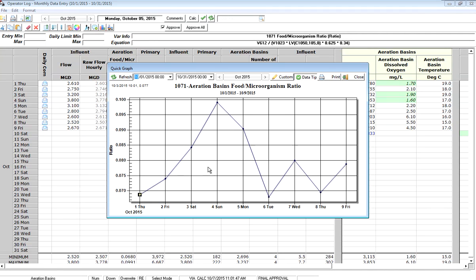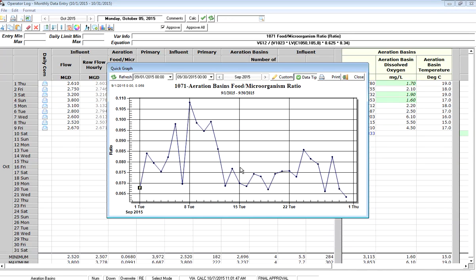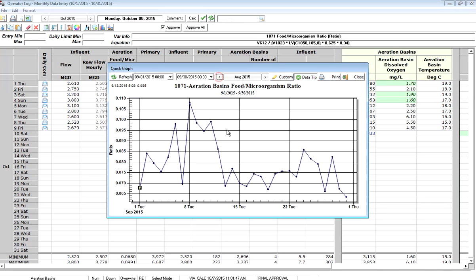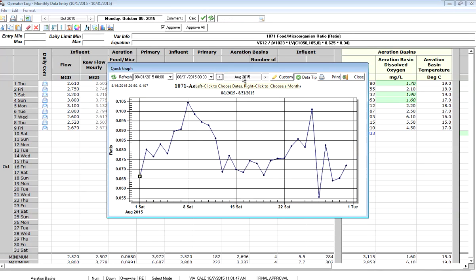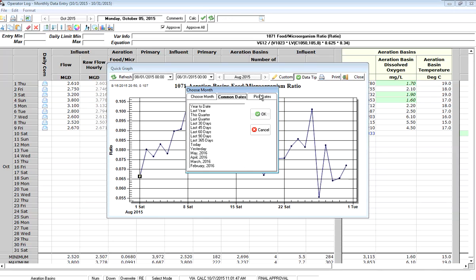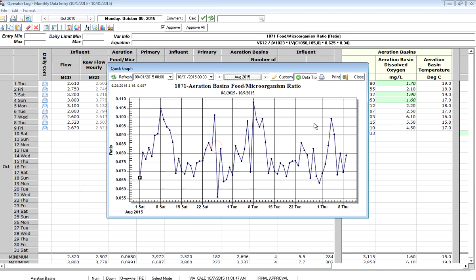So I go ahead and click that and it's going to show me for October what my trend is. I can go back month to month or just like with all the other places in WIMS, if you click on the date control here, I can go in and pick dates and say I want to go from August all the way through October and I got a longer term trend.